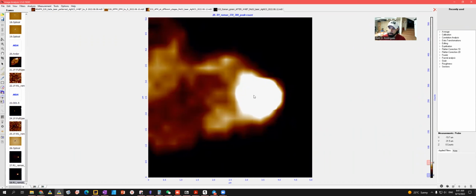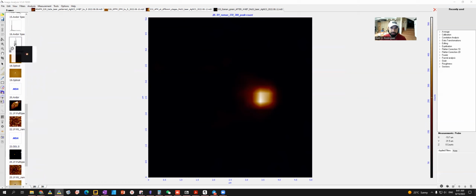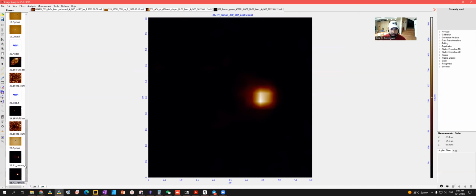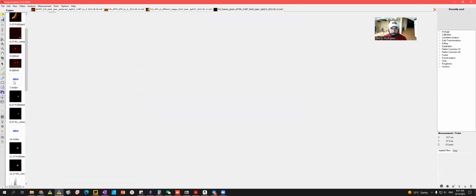If I go to the Raman map, I will see a huge part of the molecule there. The other thing is that this software is not very intuitive. I will need to remember from where this was taken. Now I remember, but for example, now it's completely forgotten. I think it was this one, number 7.